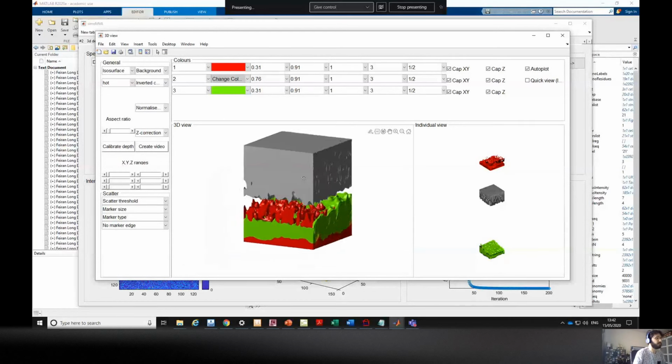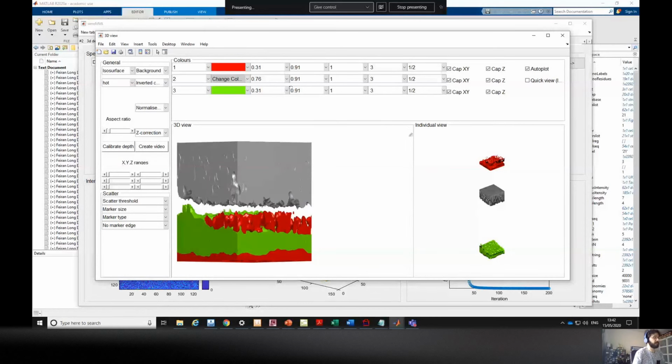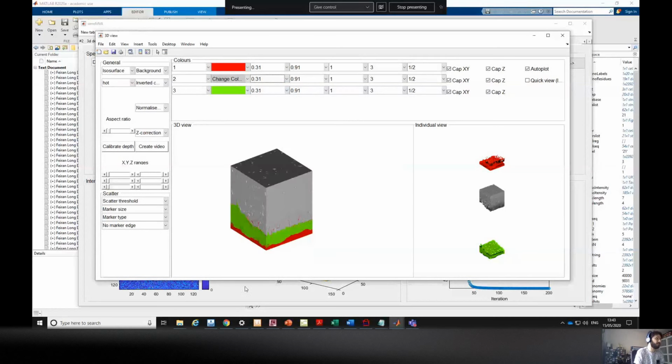So it really depends on what you want to discuss and want to show, because in a way you're just rendering things that you want to. So what I try to do in a case like this is keep it consistent. I give the freedom here for the tweaking, but I'm keeping the ranges the same so that I can trust that these are layers.